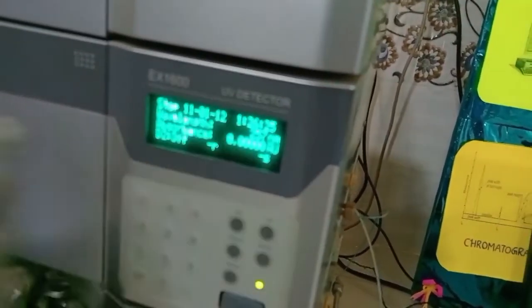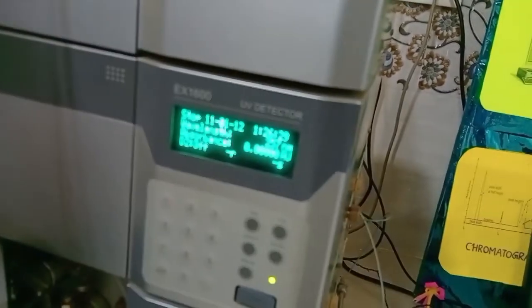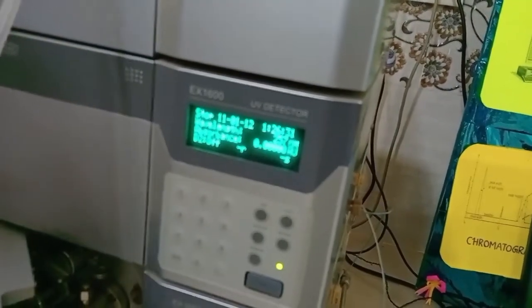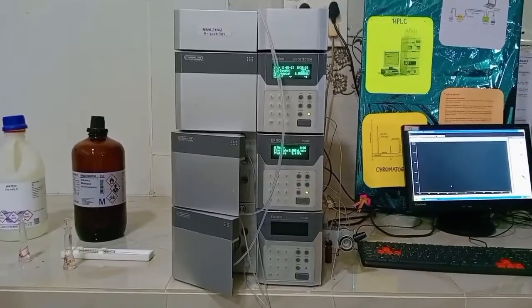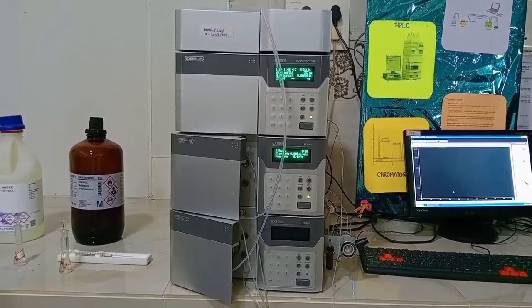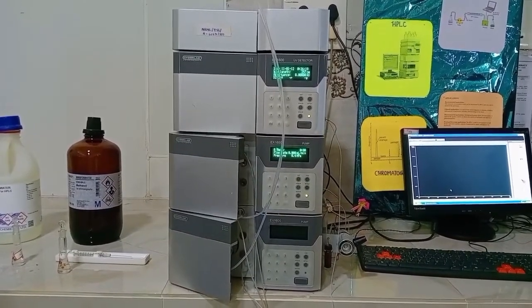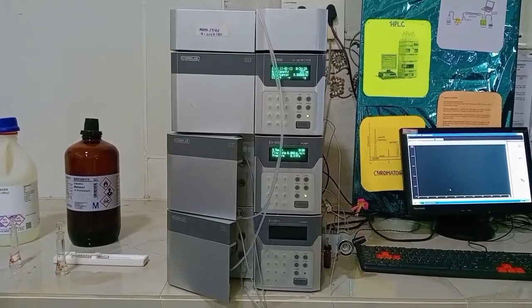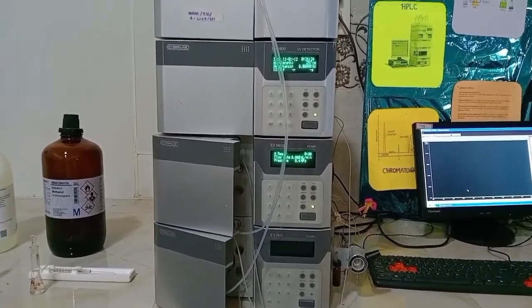In advanced equipment, there are different types of detectors, that is, fluorescent detectors, refractive index detectors, and photodiode array detectors. Before analyzing the sample, you can check the calibration status of the equipment. HPLC equipment is calibrated once in 6 months. The calibration of the equipment is done with caffeine solution. Why? Because the caffeine solution was used.